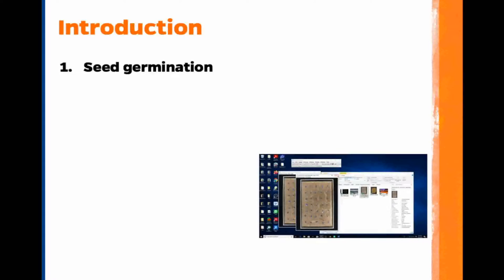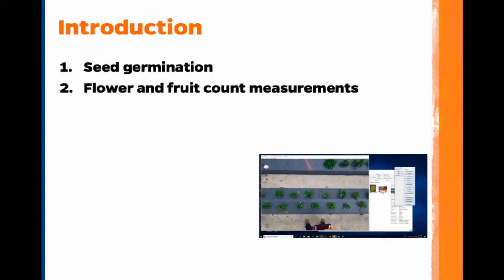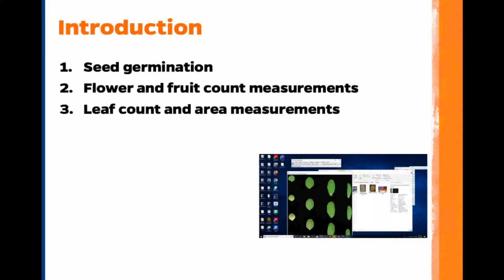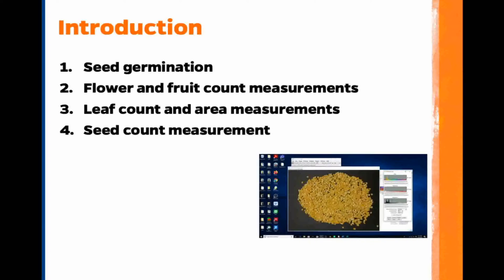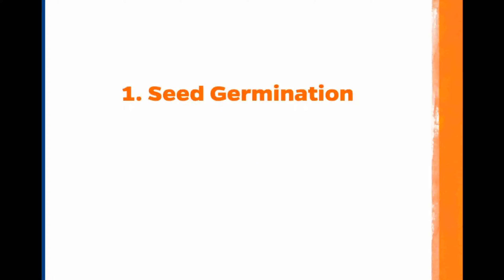This is the fourth in a series of tutorials about how to use ImageJ. In this video tutorial, we will use ImageJ's manual and automatic count features to measure common horticultural data. We will automatically measure the number of germinated seeds by counting the number of seeds with emerged radicals. We will manually count strawberry flowers and fruits. We will automatically count Arabidopsis leaves and measure the area for each leaf. And finally, we will automatically count the number of corn seeds spread on the table.